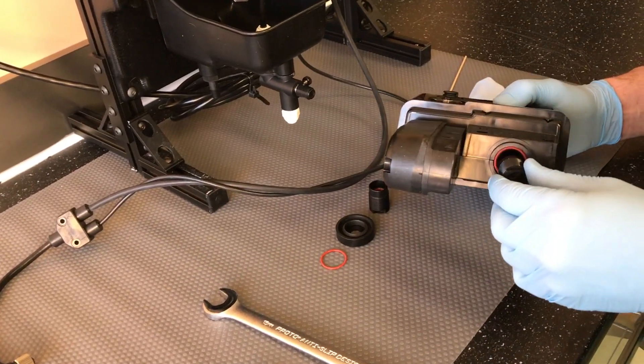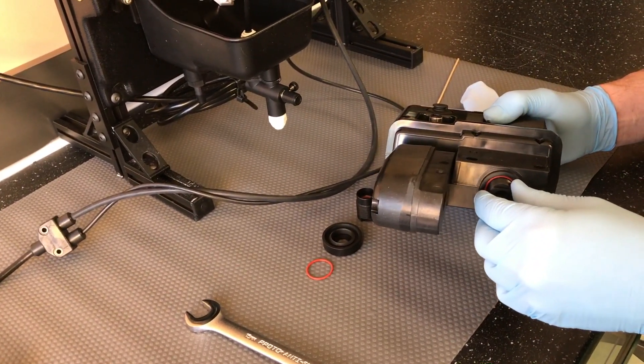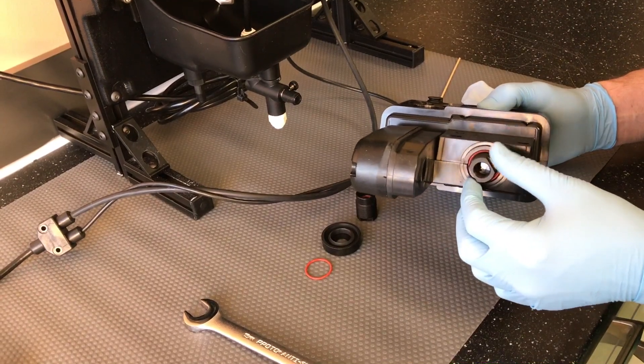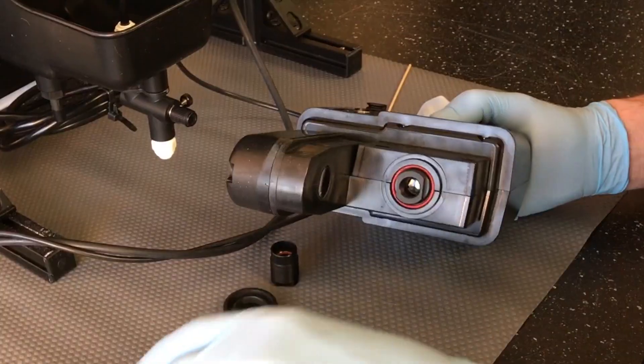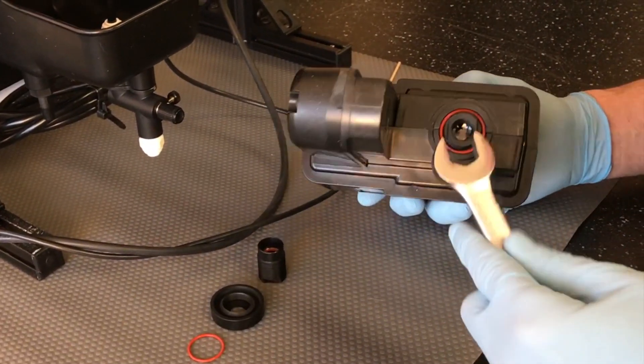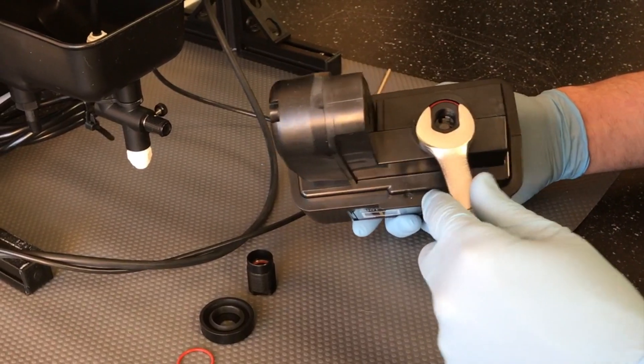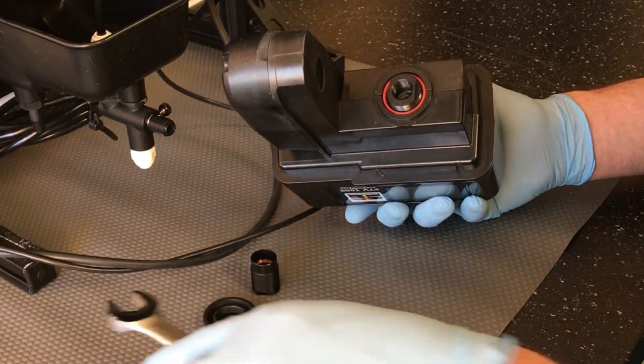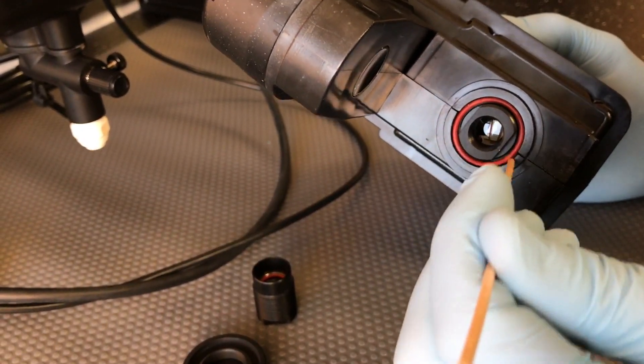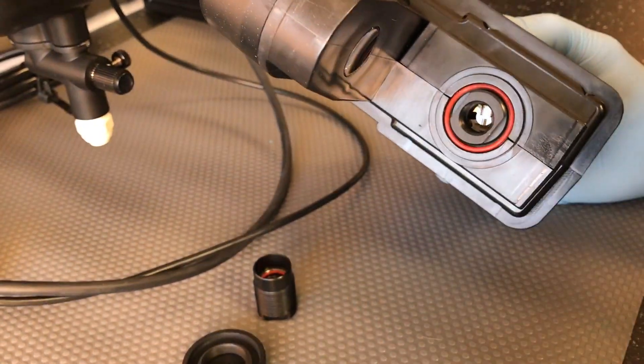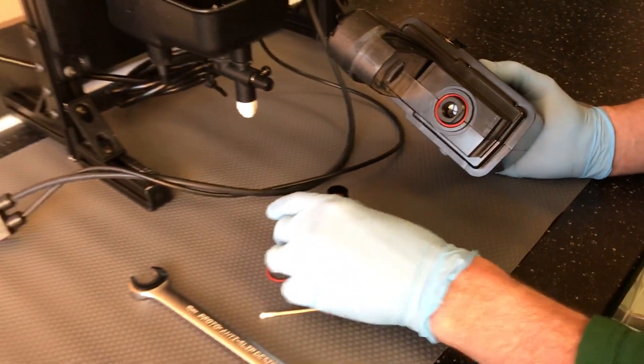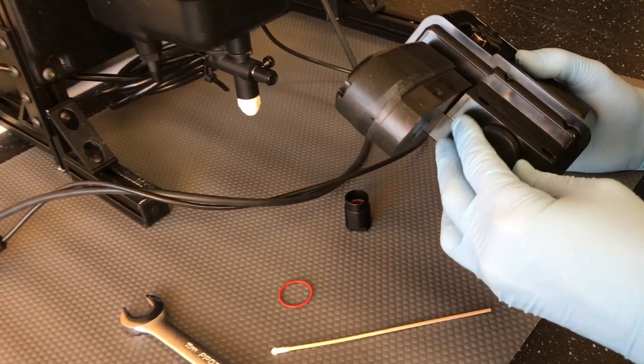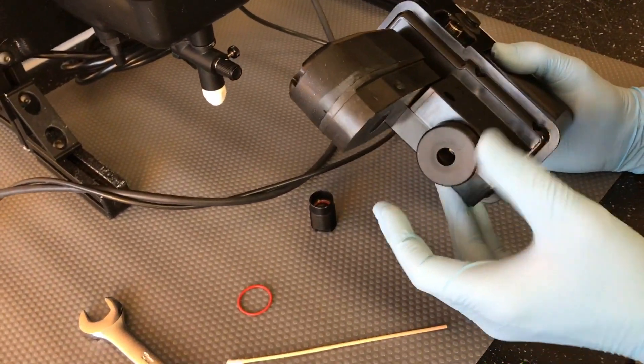Insert the lens assembly back into the measurement module and thread until it bottoms out. Very gently tighten with the wrench to ensure that the lens is fully seated. Make sure that the o-ring is seated and screw the cap into place, tightening until finger tight.